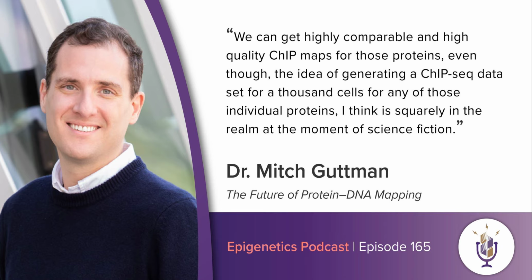And the same is true for many of the other aspects of the system, right? So there are many additional potential failure points that could lead to both reduced sensitivity and perhaps even worse, reduced specificity if not properly addressed. And so those were the kinds of things that they really systematically enumerated, thought through, and really tested, and in some cases identified issues that they ultimately were able to come up with clever solutions to address and to resolve.